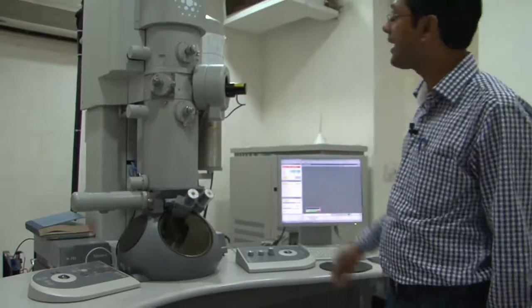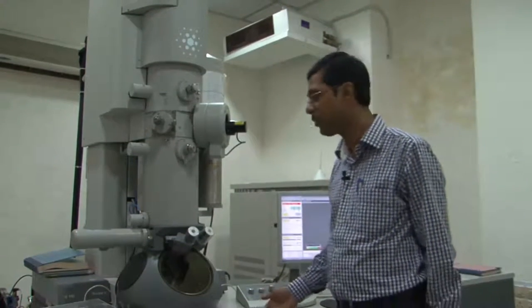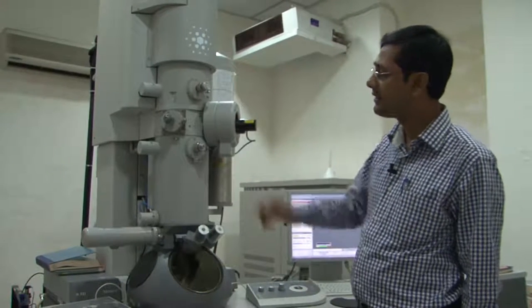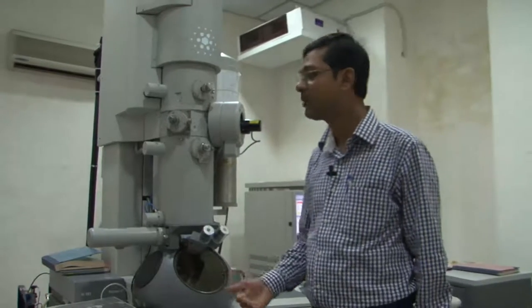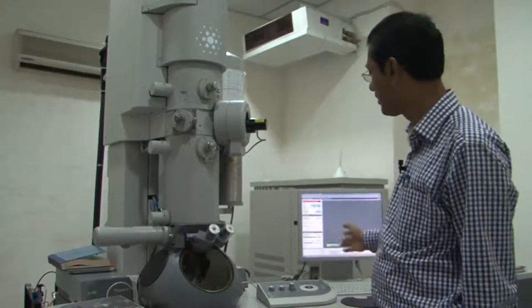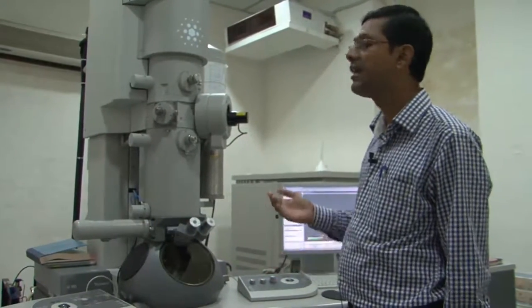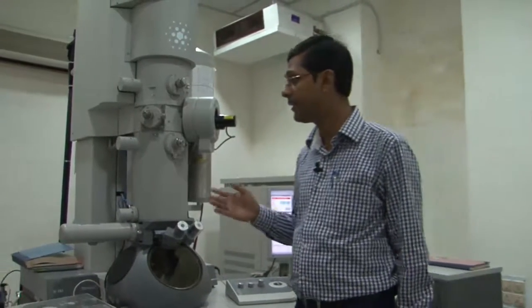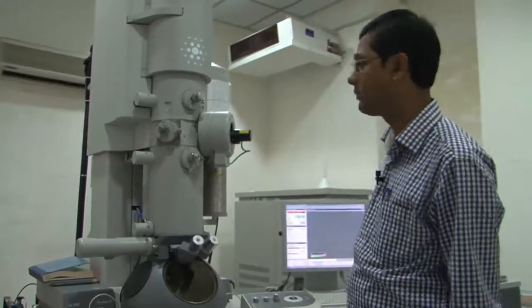So let me also tell you that as the electrons come from the source, they need to be accelerated for any electron microscope, because that is the only way the energy of the electron can be increased. This is done by a high tension tank. So the high tension tank actually steps up the voltage from the normal supplied voltage of 220 volts in our country to about 200 kilovolts in the microscope. There are microscopes which can use higher voltages like 300, 400 or maybe 1000 kilovolts. So depending on the kind of microscope which you have, you need to have a very large tank.